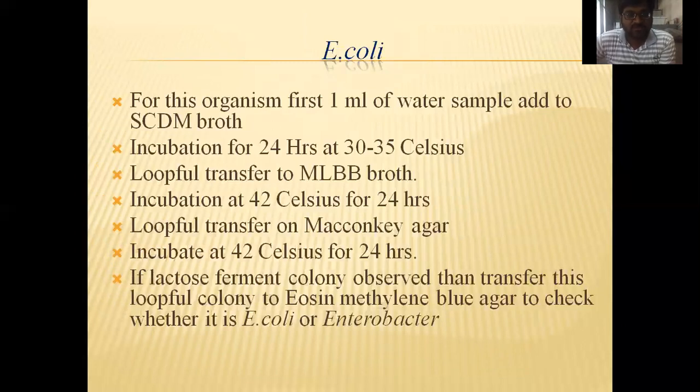So the first procedure is the same for all four organisms. For that, you have to take 1 ml water and inoculate it into the SCDM broth, soybean casein digest broth, and incubate for 24 hours at 30 to 35 degrees Celsius. On the second day, you have to take a loopful and transfer it into the MLBB broth, MacConkey lactose bile broth. You have to incubate at 42 degrees Celsius for 24 hours.